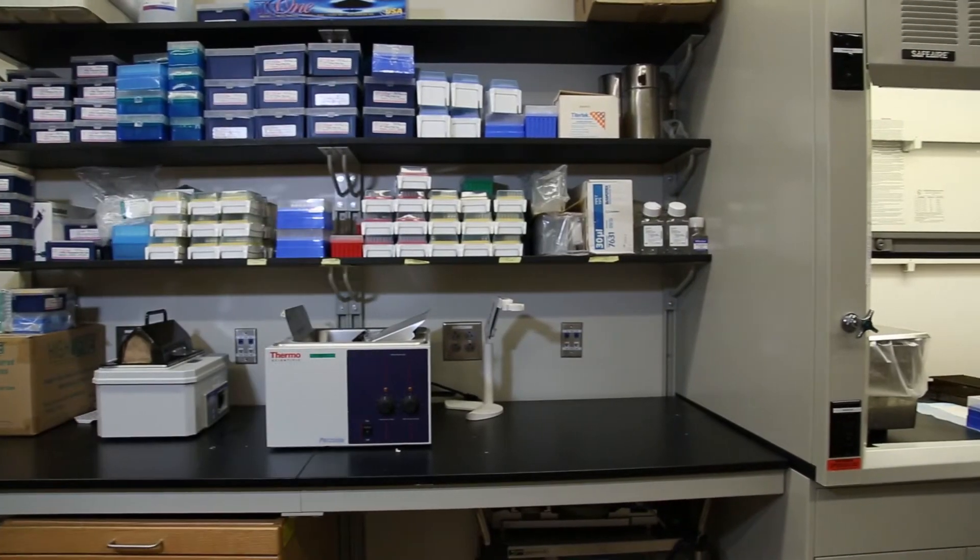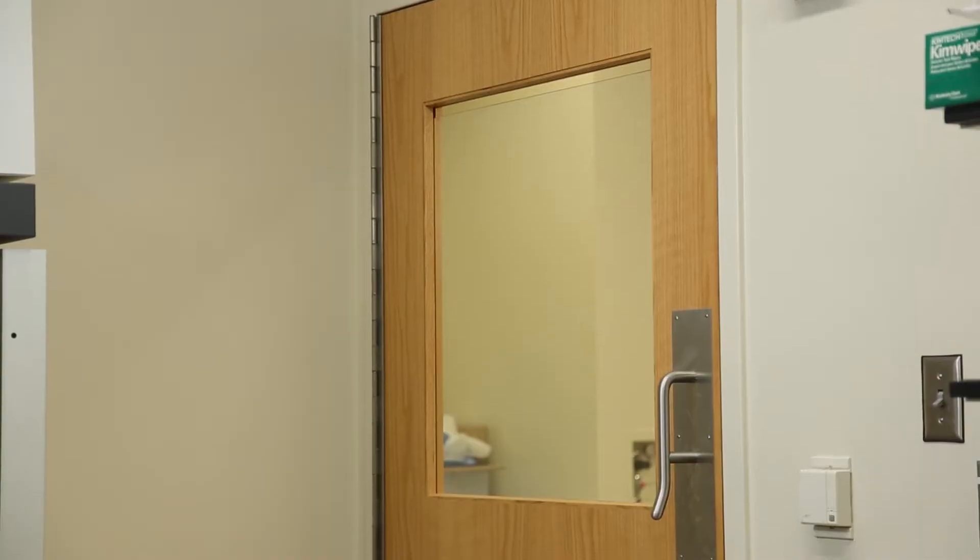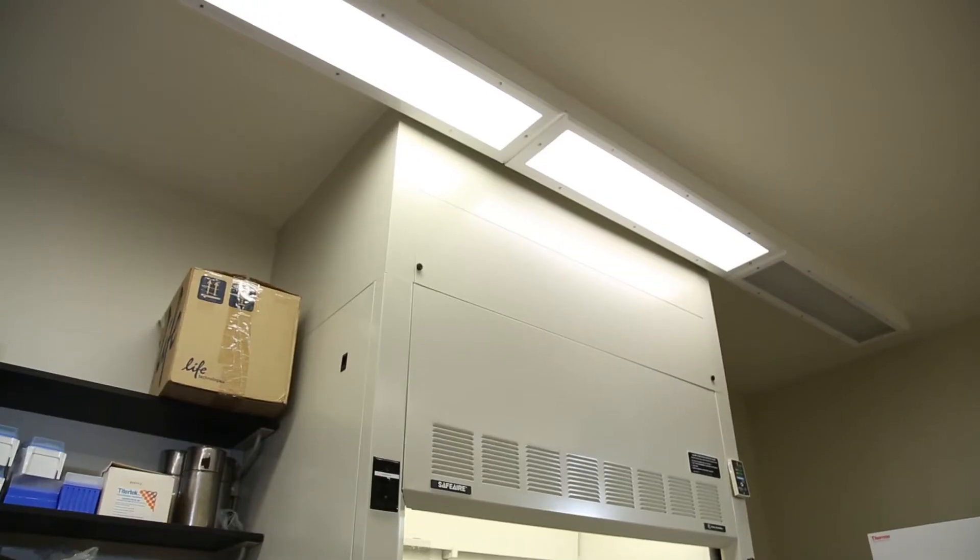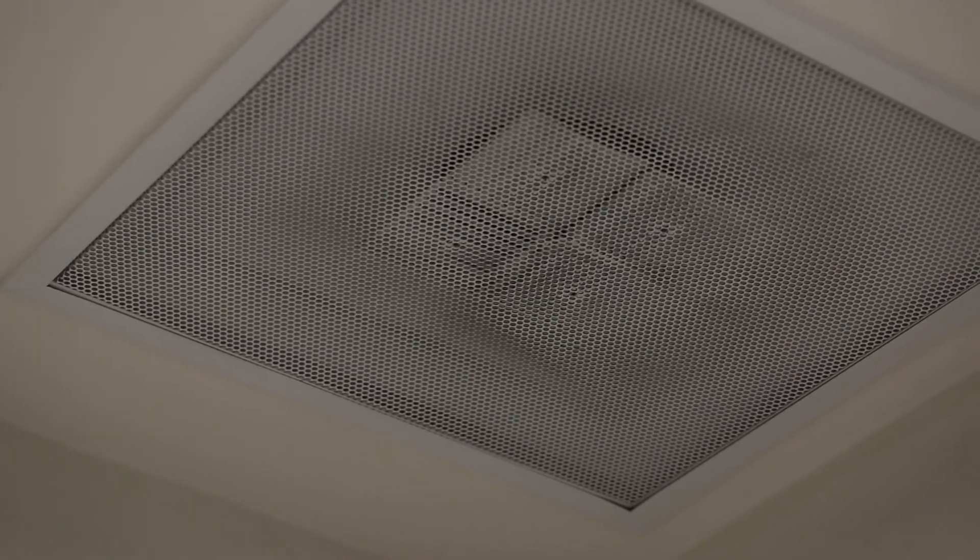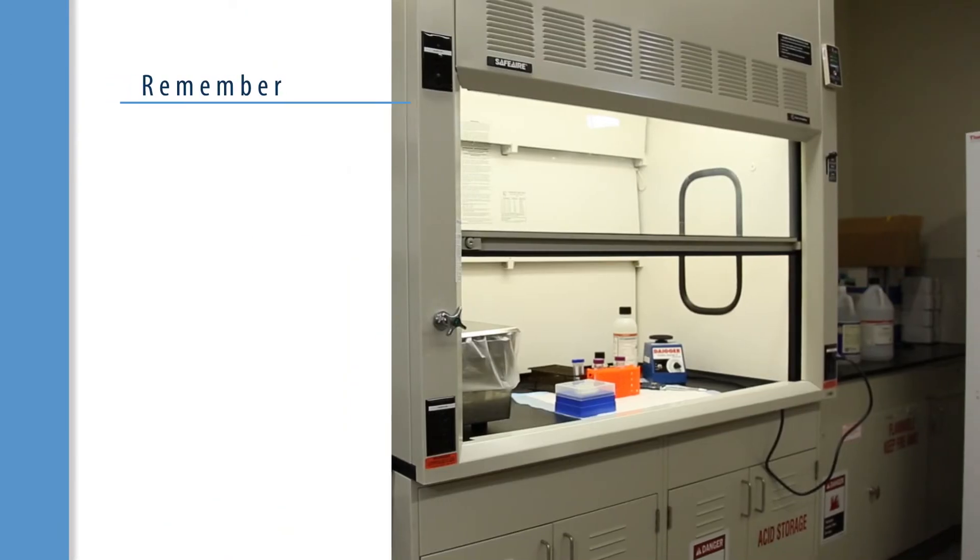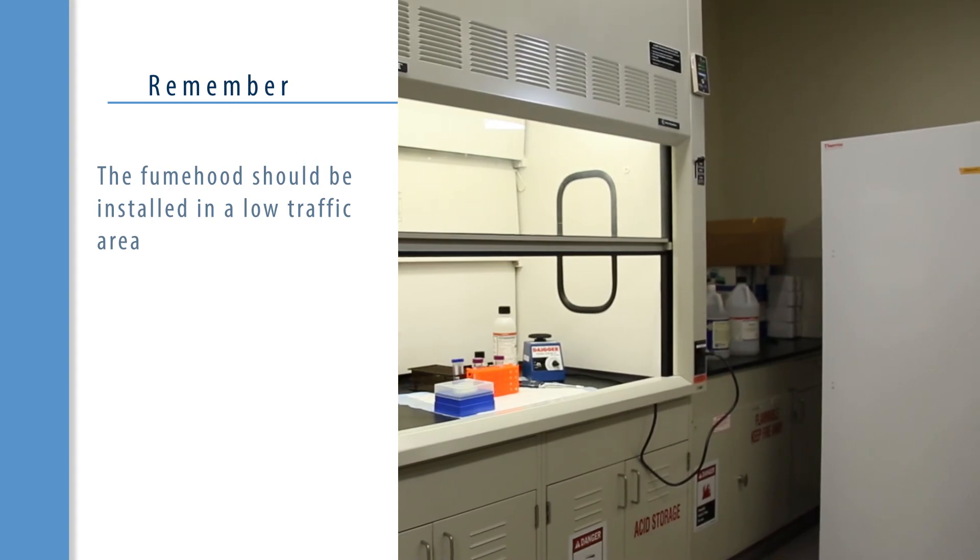The location of the hood is important too. It should be away from doors, fans, or ceiling air supply diffusers. The fume hood should be installed in a low traffic area.